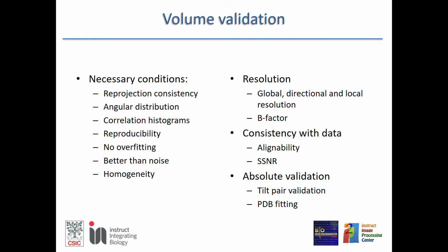And here are some tools that you may use, and they are all, I would like to say, necessary conditions, in the sense that if your volume fails to fulfill these criteria, then that is throwing some suspicion on your volume. But if your volume succeeds in fulfilling all of them, still there is no absolute guarantee that your volume is absolutely correct.